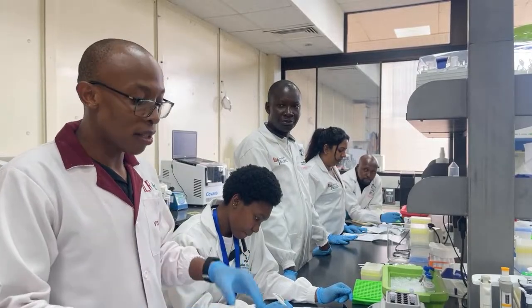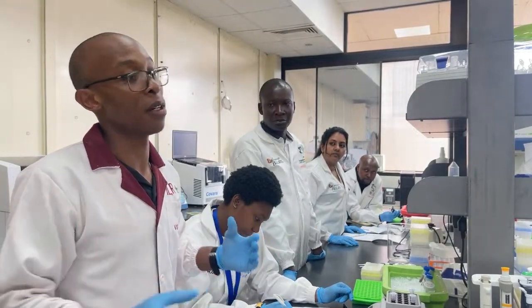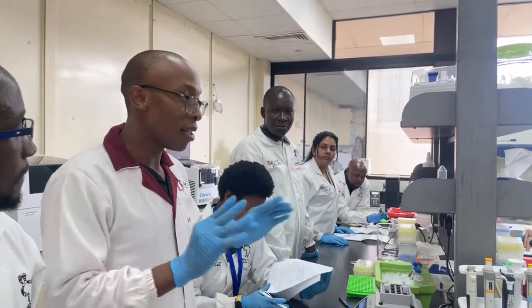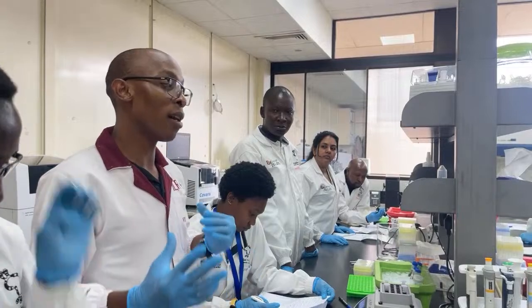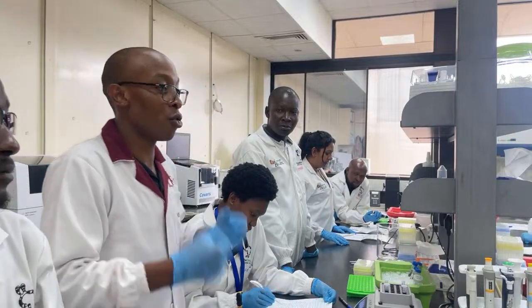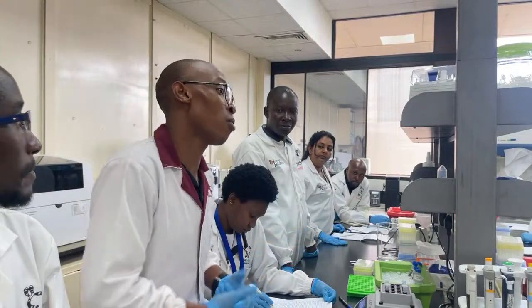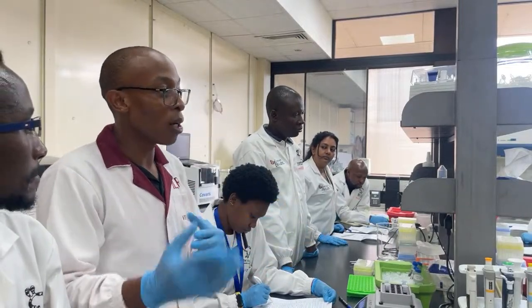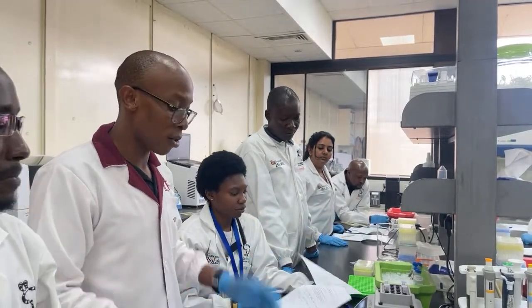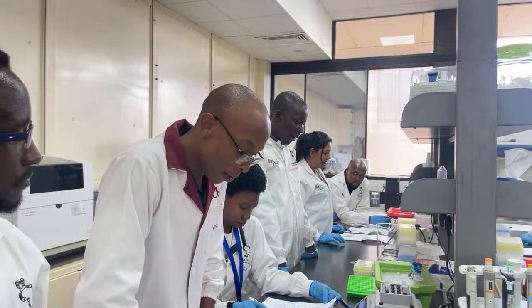Sometimes you find that we've done a lot of plant extraction with a plant nucleic acid kit. It was difficult, even from fresh tissues. Sometimes we have to adjust there and there. Sometimes you get it, sometimes you don't, and we end up having to resort to the standard kits, and say, okay, we just need to produce more data for that, maybe add another run, because we're not successful with the high molecular weight, so we have to use the normal kit. So it is what it is. It depends on what you're working with, and then take it from there.